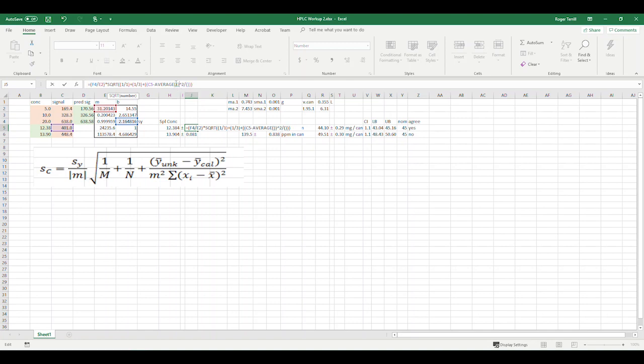So I need to go back in here. Average is going to be over these guys, right? Now in the denominator here, we've got m squared times, and this is called the dev square of x. And dev square is squared, so I'm not going to square that term. So let's see, dev squared. And again, that ate a right parenthesis, so I'm going to add a right parenthesis.